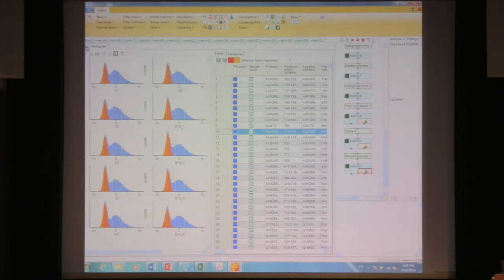Right. So you're basically looking for not creating an entirely second population, I think. Yeah, I've shown what she's talking about, so we can see what I think the question was, what you're looking for with the downshift parameter. I think Marco is best to answer this.